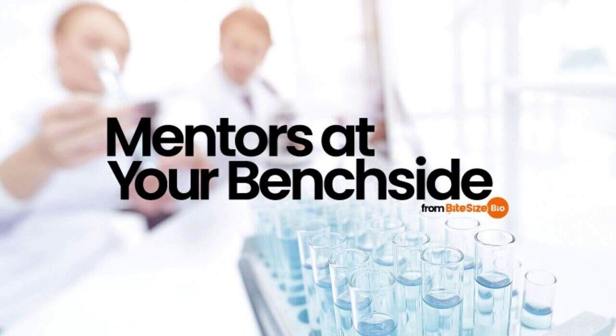Plasmid yield summarized. Plasmid DNA preps have a lot of steps where things can go wrong, but in my experience, the problem is usually either the culture or the DNA precipitation. If you are experiencing low yield in your plasmid preps, then there are steps you can take. To check if your culture is healthy, for large-scale preps, just take 1 to 2 ml out of your flask and then do a quick mini prep on it to see how much plasmid per ml is there. That will give you a good idea of what you will get from the rest of the sample.